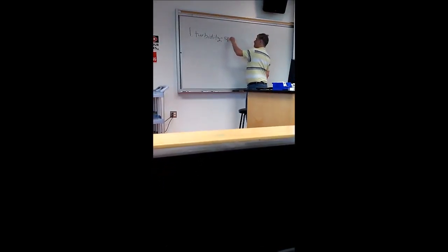But what most people do, not just colorblind people, but most people, we use digital readouts. We don't need the colors. And the digital readout involves something called the turbidity method, otherwise known as the spectral photometer. Some of you may actually have seen that one before, and maybe not. It doesn't matter actually. But the turbidity method, which means cloudiness, your nutrient broth, cloudy with bacterial growth and stuff.